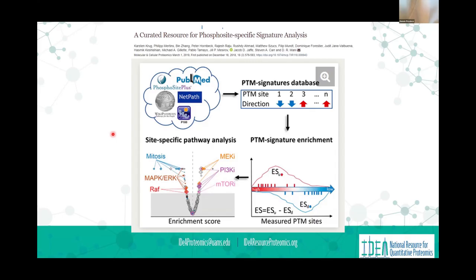The phosphopeptide, we've used 20 times more material and gone through an enrichment. And so you can't compare that intensity to the intensity of the unmodified.